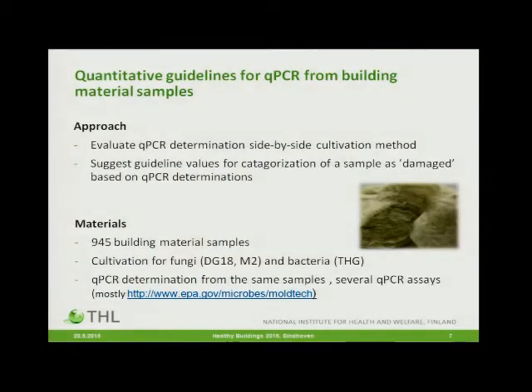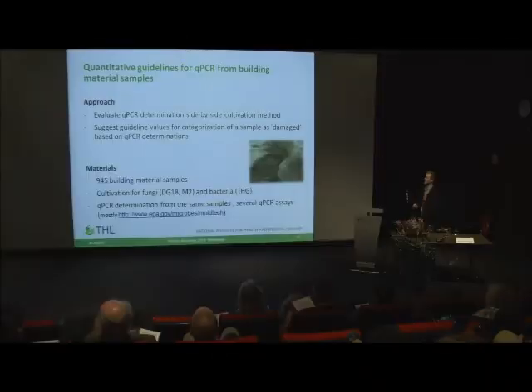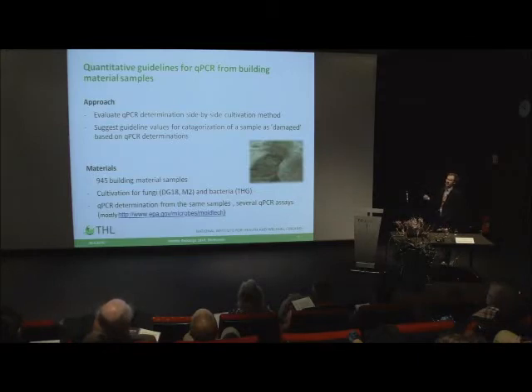All right, so what we did with the building material samples in trying to come up with some guidance is essentially we set up a database. Mark told the other day that database is a magic word, I guess, whenever we want to now start applying new methodologies into practice. So we looked at qPCR determination side by side with cultivation from a total of over 900 building material samples.